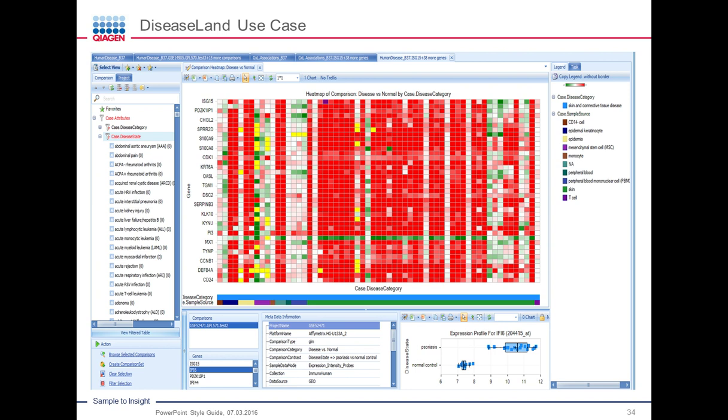In addition, oftentimes we might want to understand if this is a gene signature, some of these genes could potentially be used as predictive biomarkers. And we might want to know, for example, is that only the case if I had skin samples, or is it possible that this could be a predictive biomarker in a disease versus normal comparison? So, for example, a control individual versus someone with psoriasis. And could we measure these markers and identify differential expression in other tissue types? So, for example, peripheral blood.